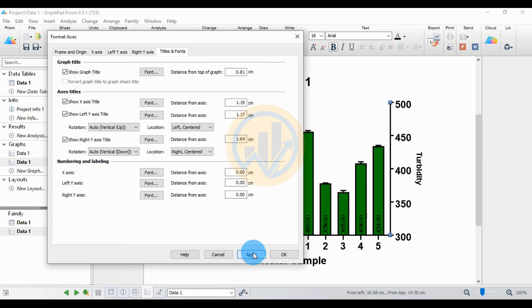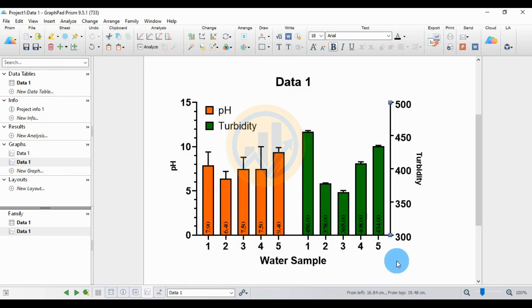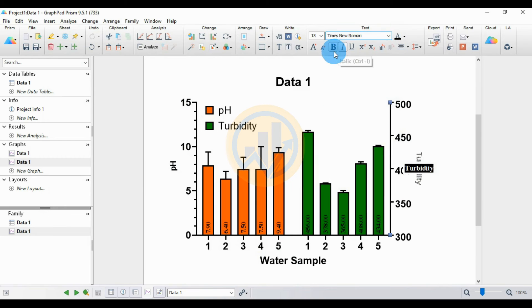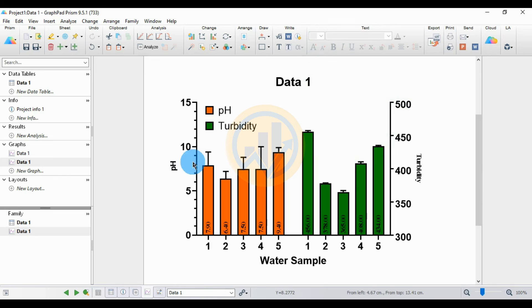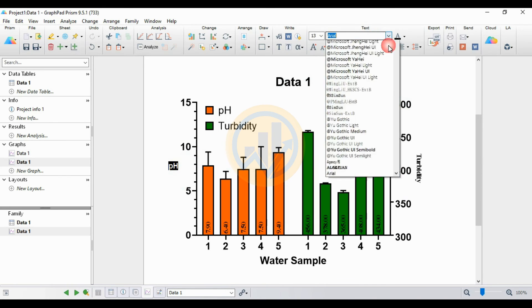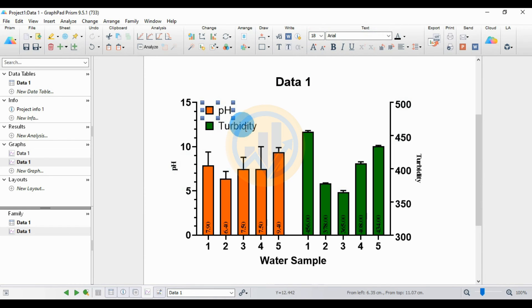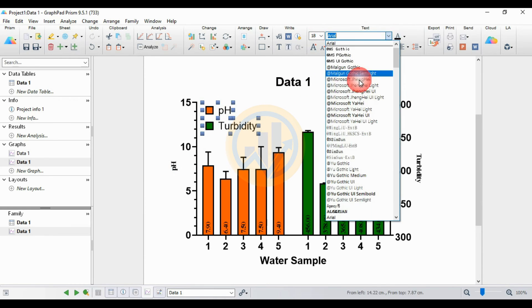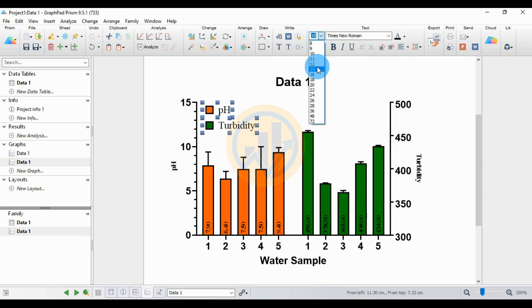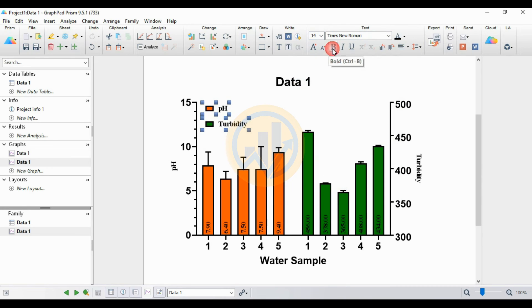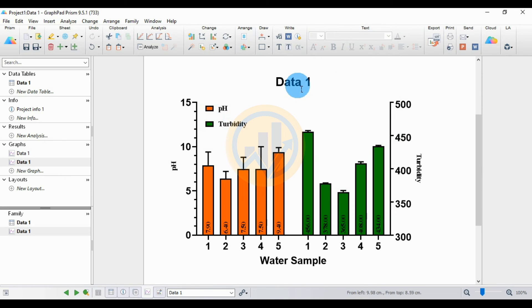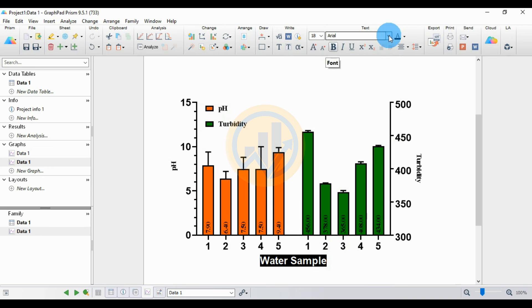Now manually change the title fonts. Change the turbidity axis title font to Times New Roman, size 14. Also change the pH axis title to Times New Roman, size 14. Change the water sample axis label font to Times New Roman as well.